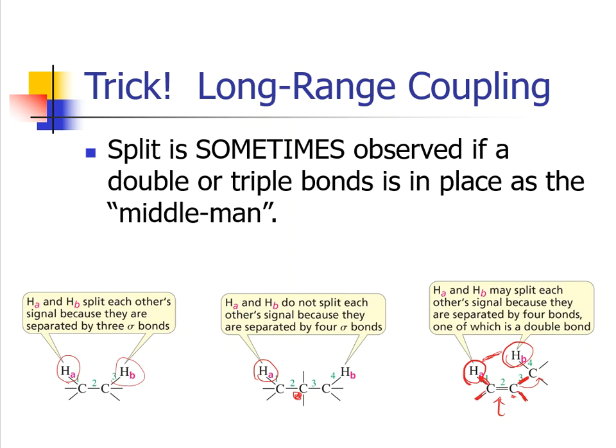We are now getting into the extremities of the NMR world, but keep in mind that double bonded carbons, based on their orientation about how they're made structure-wise, those 2-door down carbons, the Dolly Parton carbons, can have protons on them that are greatly nearby. So that means these two hydrogens are almost like next door to each other, and because of that, they can affect how each of them begin to split.